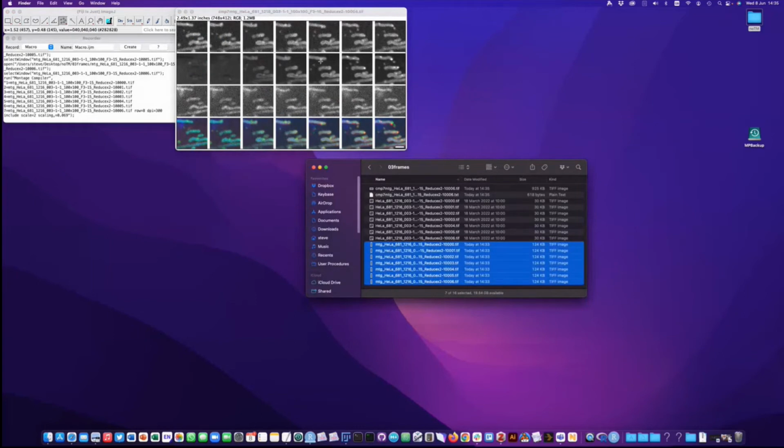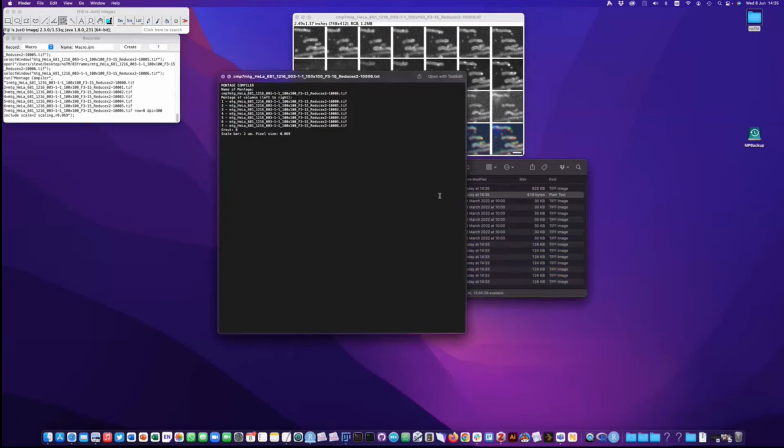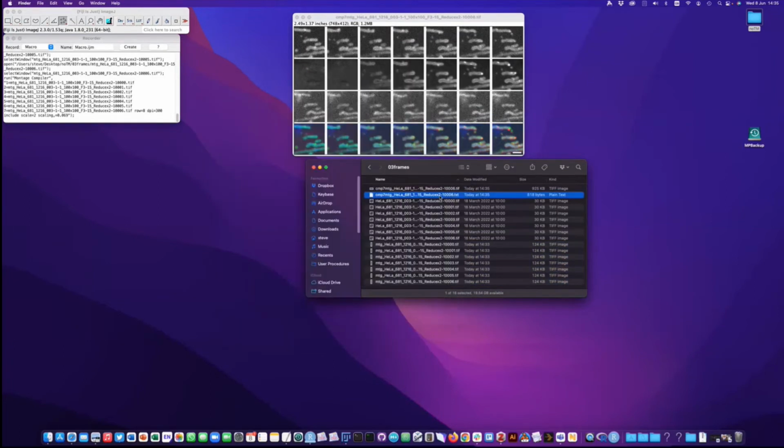and we get our lovely montage here. It goes across the image now with these vertical montages going down, and the scale bars in the corner. It's a nice size. And again, we get an output here of what we did. So that force other orientation, you might want to do that if you wanted to put together, you know, two rows. Say you had two conditions that were going to be side by side in a big panel. You could put those two rows together one by one, and then compile the montages the other way.